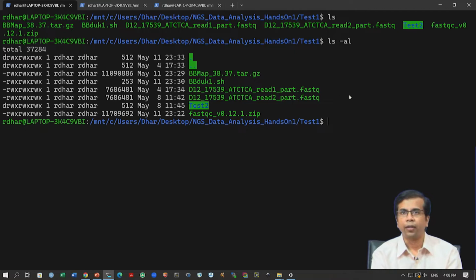As we have discussed, the fastq files generated from the Illumina platform are huge in size, really big, because you have millions of reads in there. If we did the analysis with that kind of data set, we would not be able to complete this hands on within a reasonable period of time, because all the steps would take a long time.